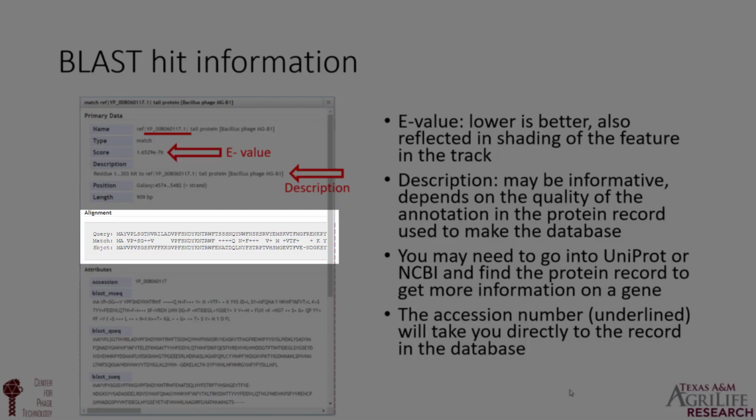This shows the match line for the alignment between your sequence, which is the query, and the subject, which is the hit in the database. Obviously, the higher quality alignment here indicates a more reliable blast hit.